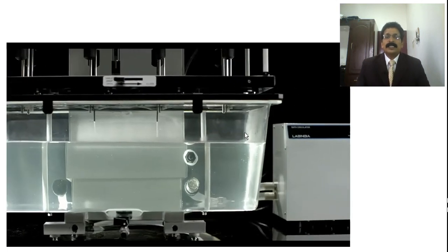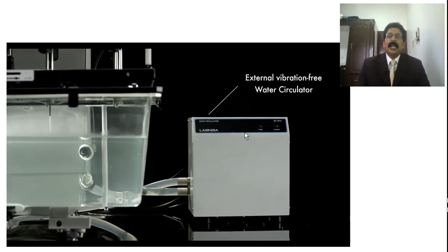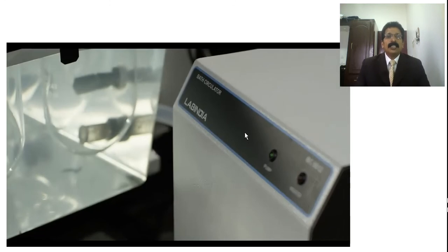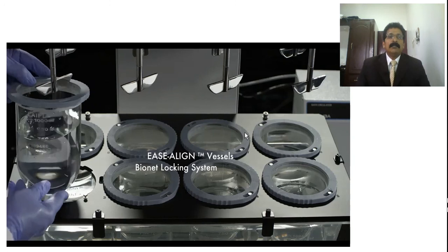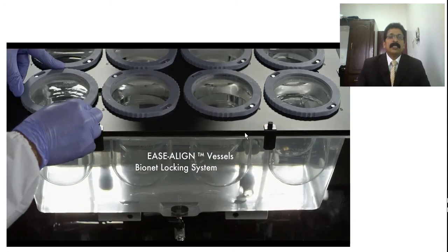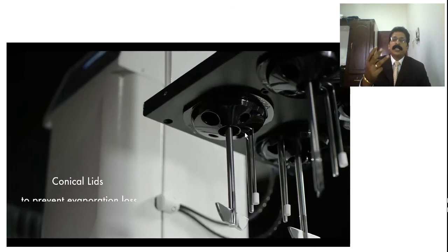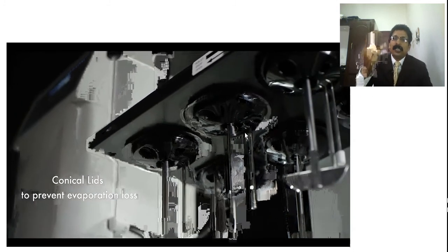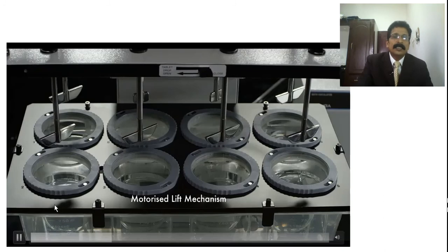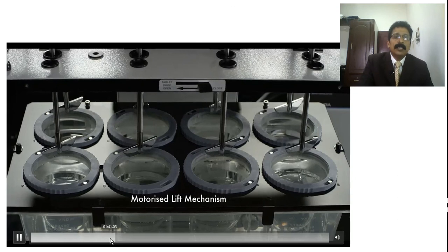Afterwards you can fix it automatically. This is the gastric fluid which is already prepared, and it will enter the Lab India instrument and automatically enter all the chambers. You can see the gastric fluid solution is kept, and there are 3 knobs inside: one is the paddle, another is the temperature controller. Just a minute, you can see there are 3 knobs. That is what he has shown.